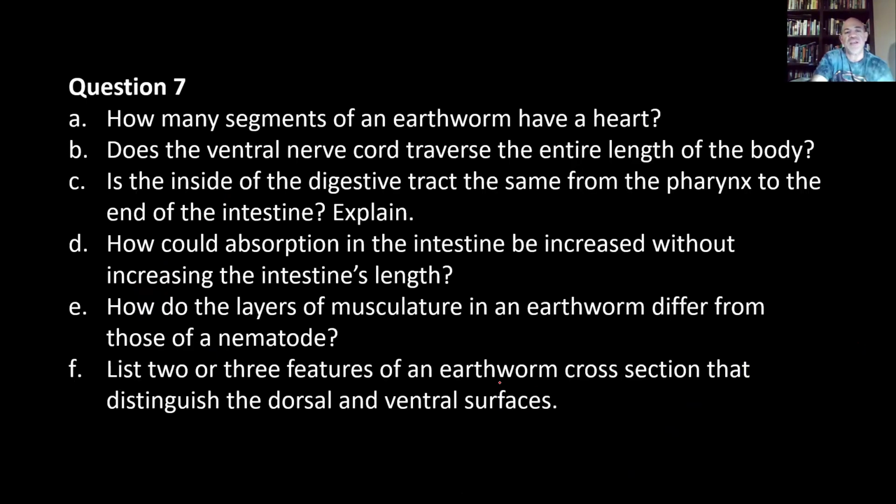And so here are questions to answer about the observations related to the dissection, observation, and the cross section through the animal. So make sure you go through those and answer as many as you can, just to improve your understanding of what you've seen. And then make sure you can identify those anatomical structures that we saw of the animal, external, internal, and cross-section through the animal. I'm not going to read through these because it takes too much time on the video.